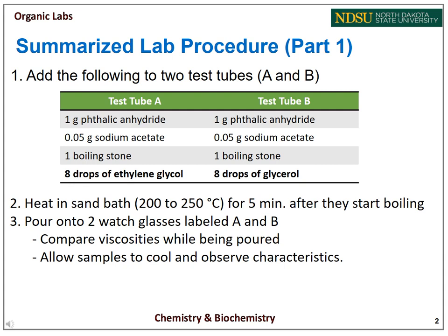When preparing the sand bath, you will need your crystallizing dish, and to that you will add sand. When you are done with the sand, please return it for reuse and do not dump it in the garbage. We'll be using these for future lab sections.